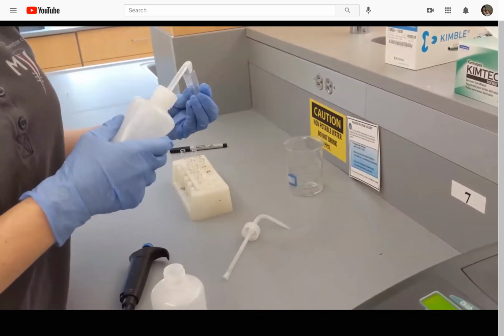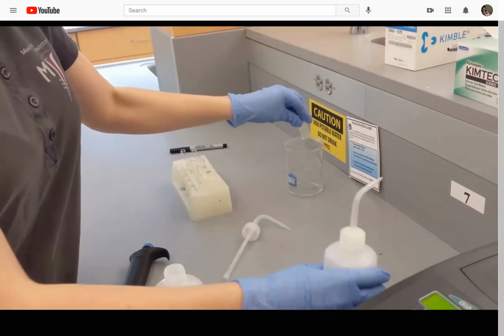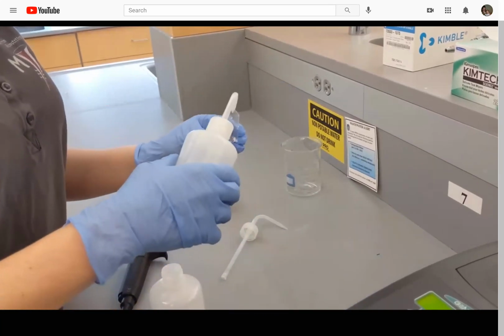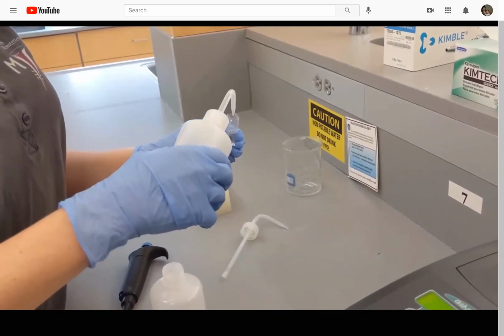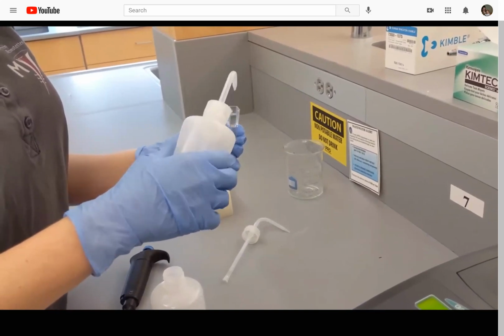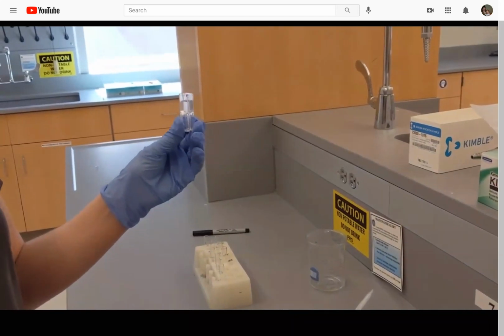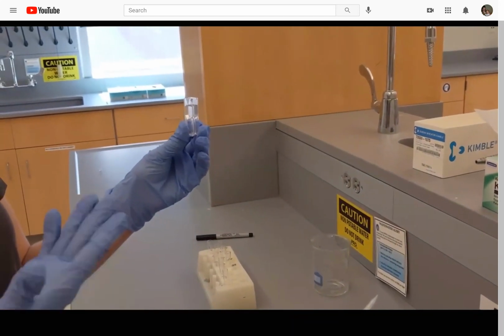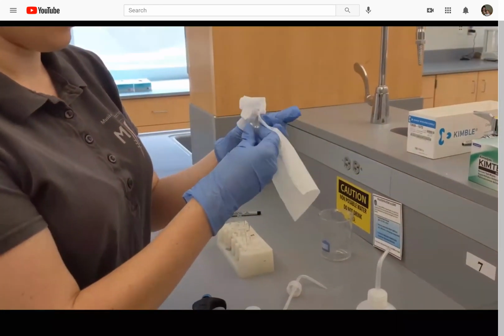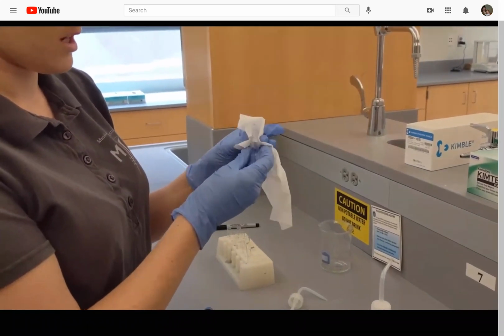Just making sure to get the sides. I'm then going to go ahead and fill it with some DI water, making sure that I have enough liquid in there that when I put it in the spectrophotometer, it will be at a measurable level. So I'm going to wipe it off with a Kim wipe, make sure it's completely clean, there's no smudges on the outside.